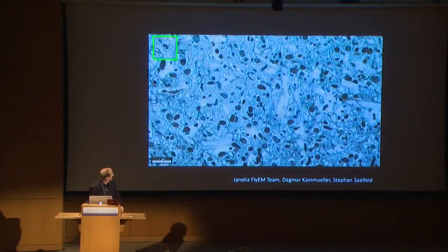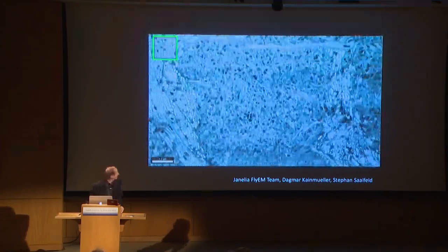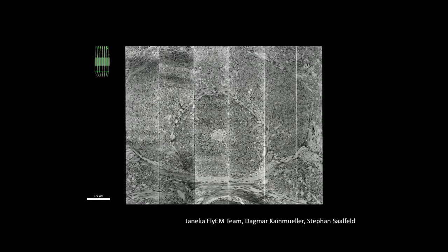It's amazing that this thing self-wires, and it looks so disorganized, but in the end, it really is organized. And there are the different modules. We're zooming back out. Here you can see the whole upper head of the fly brain. Remember, these are several slabs, and we're just going to go through 6 of them. We have 13 altogether. This represents about 2 years of imaging that we've done, which has completed this. And what will come next after this, we want to try looking at a male fly, but doing it in its entirety all the way, and that'll be a larger imaging effort.